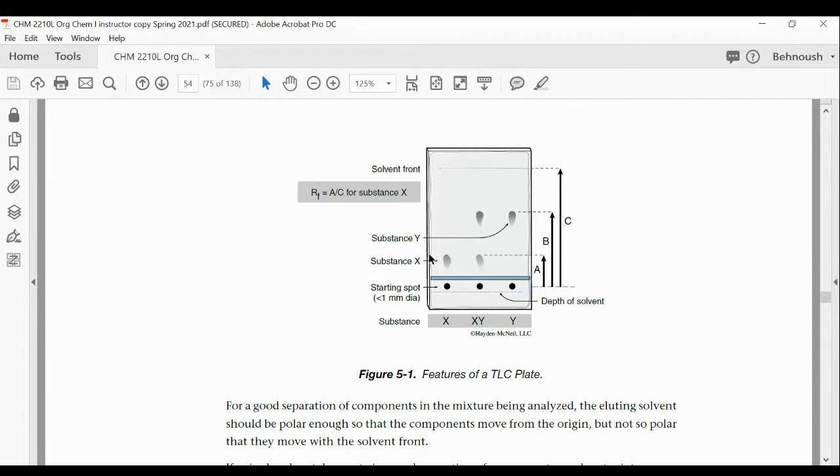One could stop right here, one could move up here, and the other one could move up there. But horizontally, there is no separation. And if horizontally there is no separation, you don't know which sample moved up to point A and which sample moved up to point B, because you have a line. So basically, there's no horizontal separation. You want the separation to be vertical and horizontal.